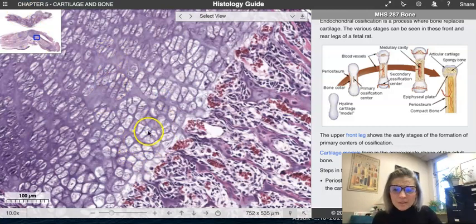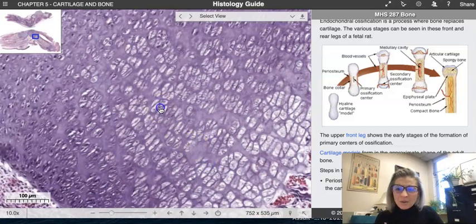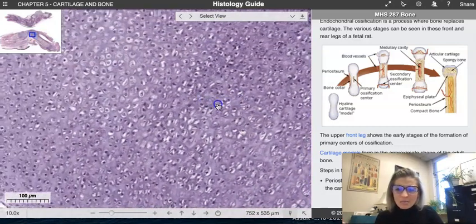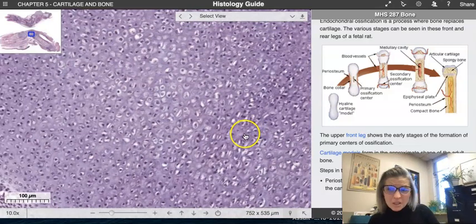And this is what I find typical, that confusion that happens. And it's like, which way is the growth plate going? And there's this trickling effect of cells coming this way. There's all this big white space, and then you're heading up this way, and then things just dissipate, and then you get really consistent cellular material.